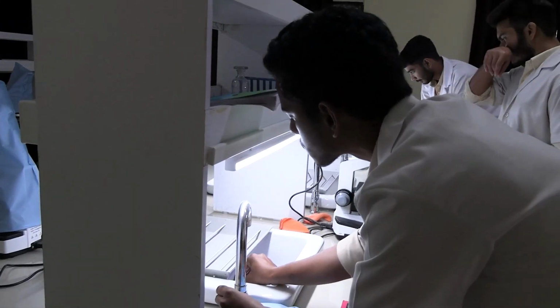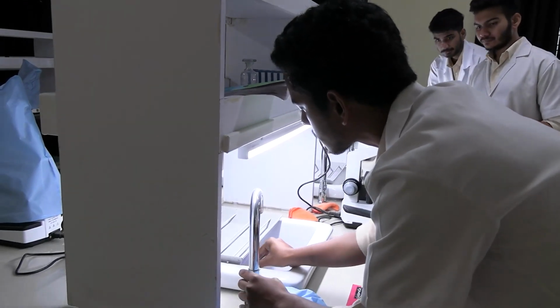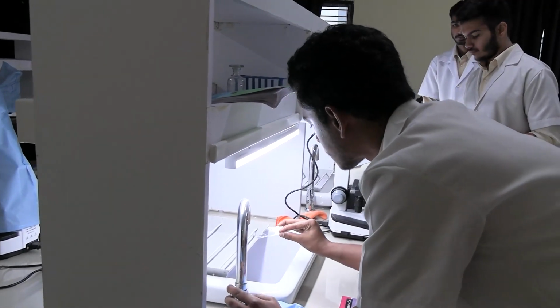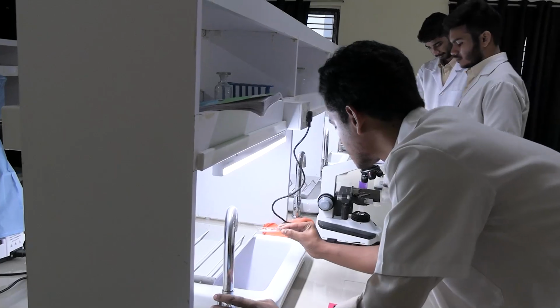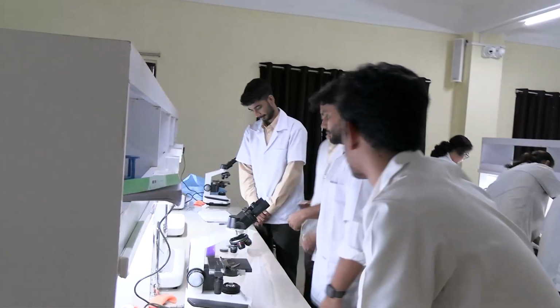Okay, the Mordant is the second step, so you're gonna pour the Mordant over there and keep it there for 1 minute, okay? You are keeping track of your time now. You are also keeping track of your time. So, what is the second step? Mordant. Mordant, okay? So take the Mordant.